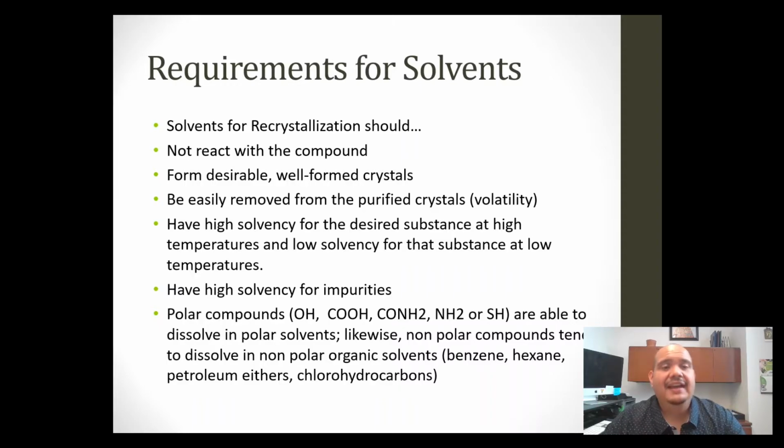Okay? And a solvent should have a high solvency for the desired substance at high temperatures and low solvency for a substance at low temperatures, meaning at high temperature, that solvent should dissolve the solute. And at low temperature, it should not dissolve. And that is a very, very important trait that you should write down to remember that a solvent for recrystallization should have.